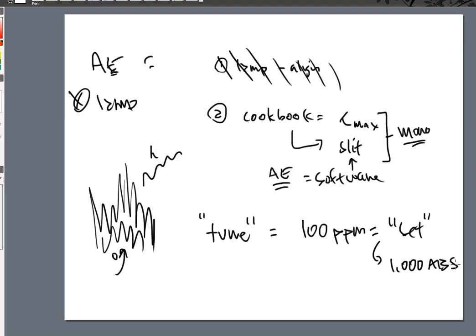We've talked about absorbances. We've talked about this idea that we have a working range, and that working range should be like nothing lower than 0.2 and nothing greater than 1.5. So the AA and the AE instrument knows this because it's very similar. And it's like, I don't want to go all the way to 1.5 because there is a chance that maybe some of your samples or some of your standards might run over 1.5, and that's not really a legit number.